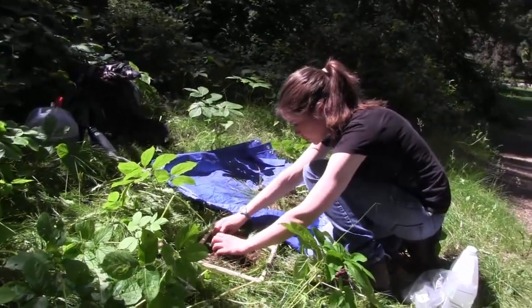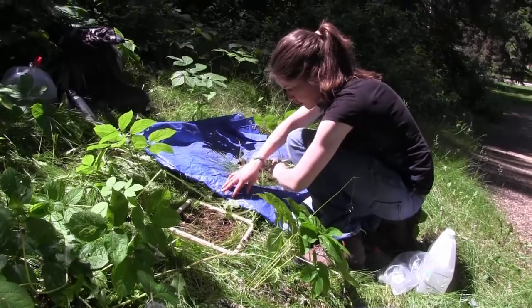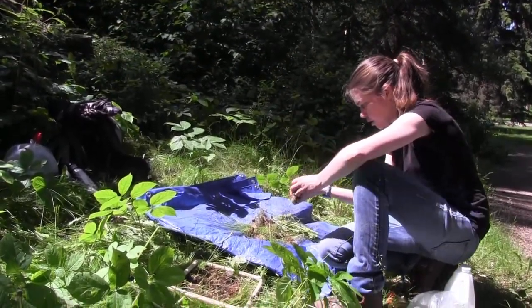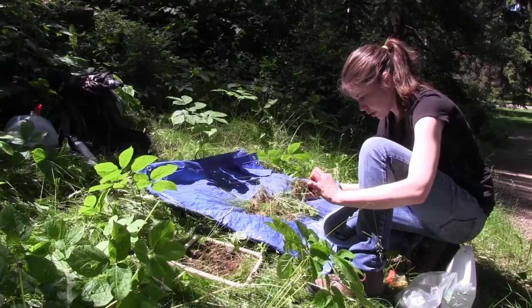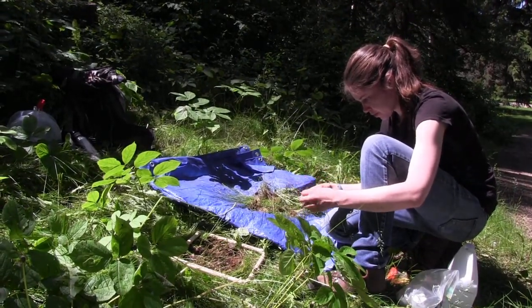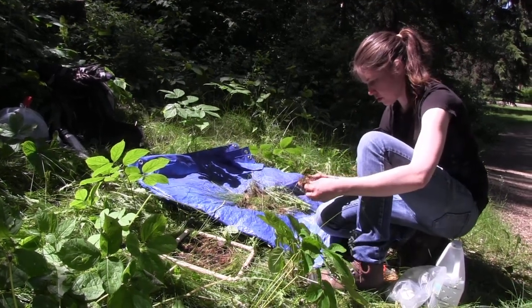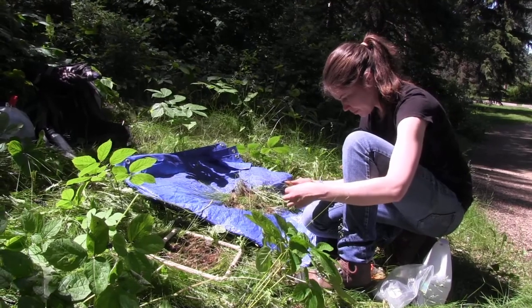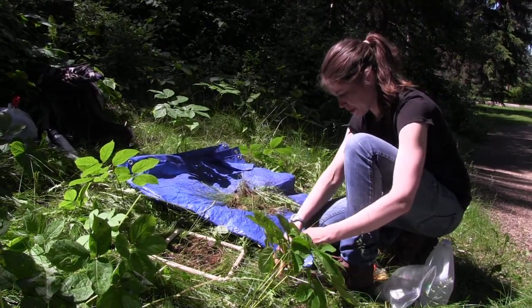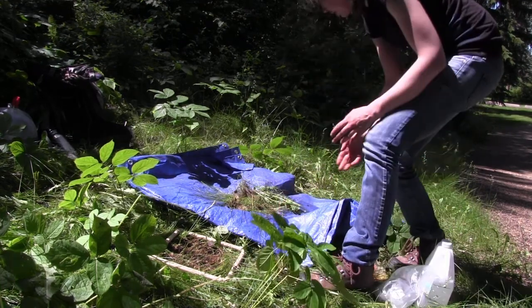So once I've removed most of the loose leaves from the surface of the soil, then I sort through it all, just looking by hand and breaking up clumps of leaves. And sometimes the earthworms can be quite small, so it's important not to go too quickly through the soil.